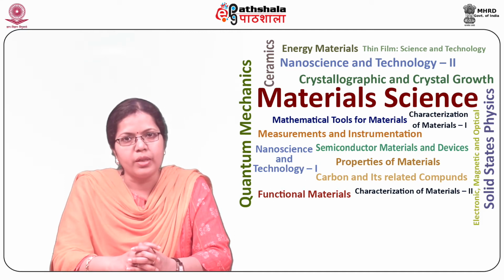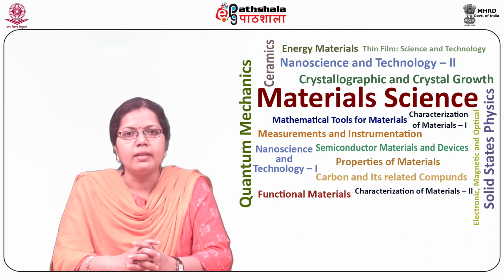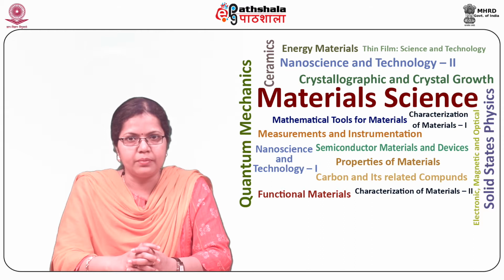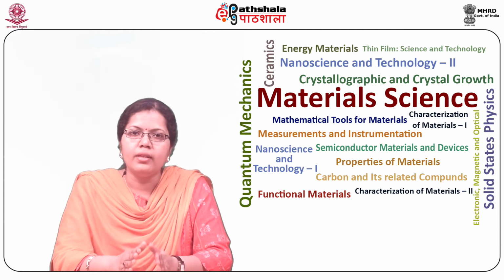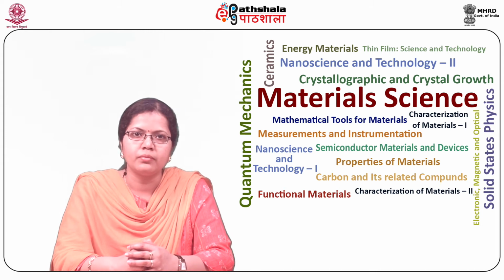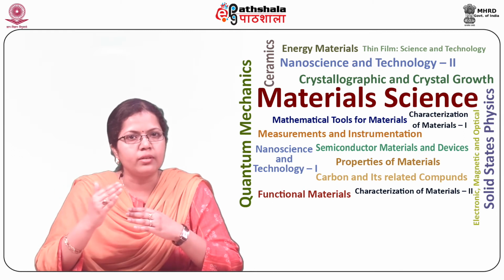In light microscopy, dispersion staining is an important tool based on the variations in the dispersion curve of an unknown material with respect to a reference material. The dispersion curve of the reference or standard material is compared with that of the sample under investigation. The dispersion curve changes because of the refractive index of the investigating material.